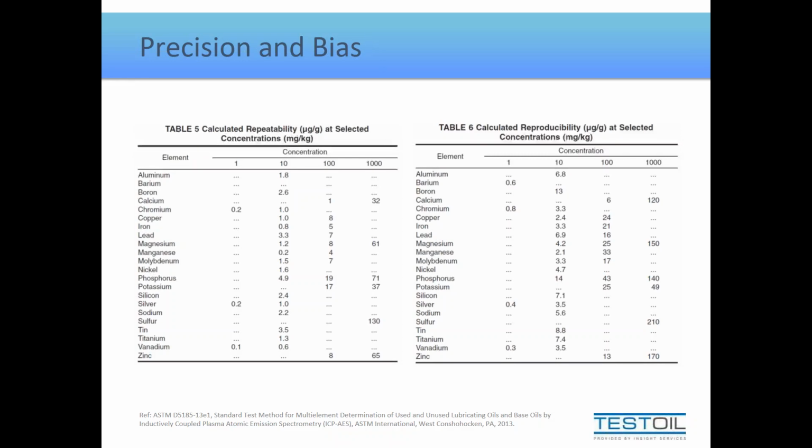Another thing I like to point out while we're looking at tables like these is just to define what exactly a part per million is. 1 part per million is 1 in a million. But what we fail to understand is that 1 part per million requires the same amount of material to generate 1 part in a million, whether it is an increase from, say, 1 ppm to 3 ppm, or from 11 ppm to 13 ppm, or from 101 to 103 ppm.